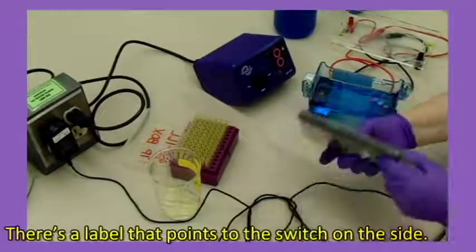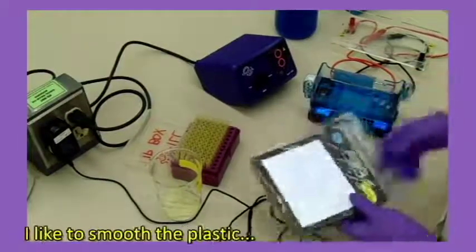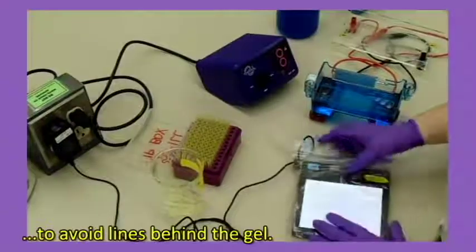There's a label that points to the switch on the side. Turn the light on and lay it flat on the table. I like to smooth the plastic to avoid lines behind the gel.